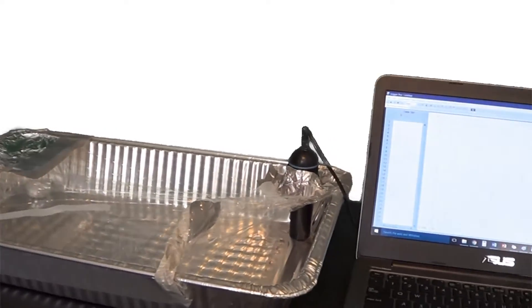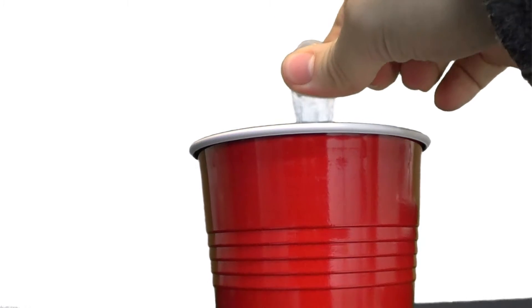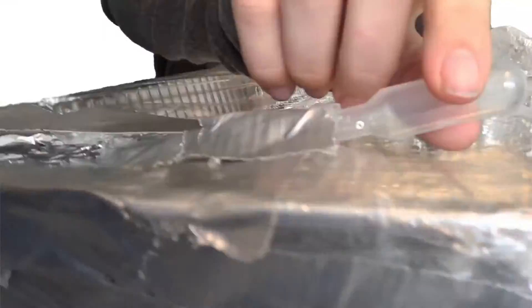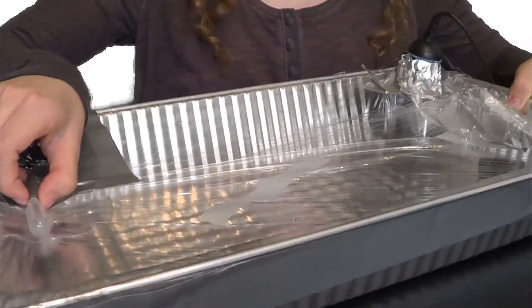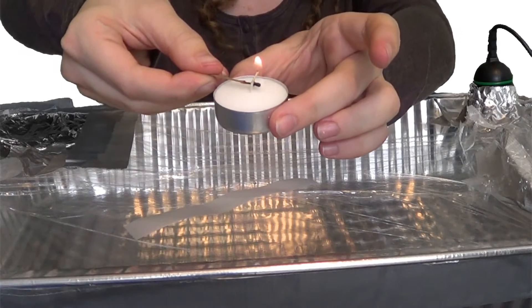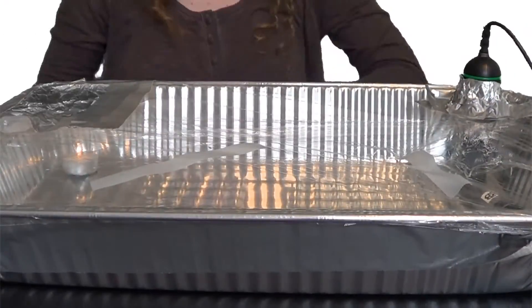Connect your oxygen sensor to your laptop or computer and bring up the corresponding software — we used Logger Pro with the Vernier O2 gas sensor. As long as the sensor is working properly and your specimens are in place, remove your pipette from the opening and fill it with some water. Once full, insert it back into the opening and seal it down with tape, making sure you are also able to move the pipette back and forth. This is so that when the time comes to put the candle out, you can move the pipette over the flame and dispense the water. Now comes the time to light the candle. With the candle burning, take tape and seal down the cover as best as you can, trying not to leave any openings, as this will cause problems keeping the oxygen levels stable.